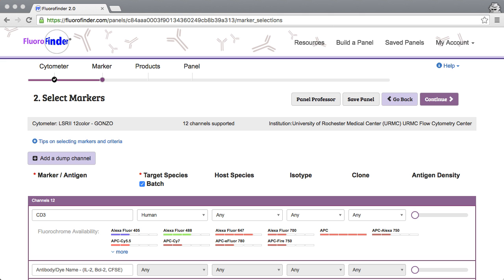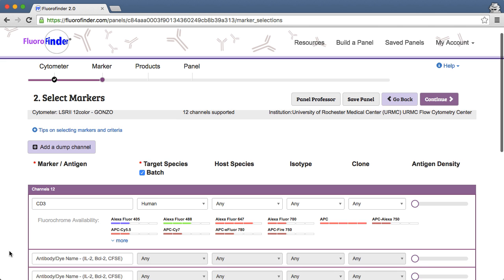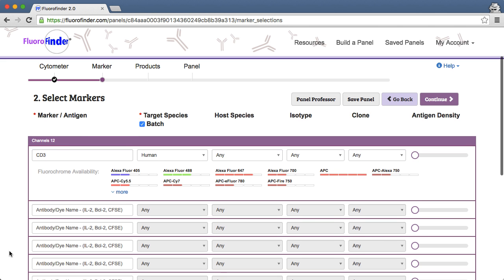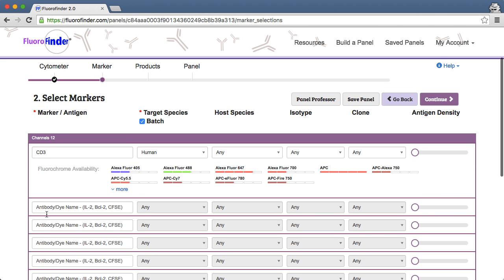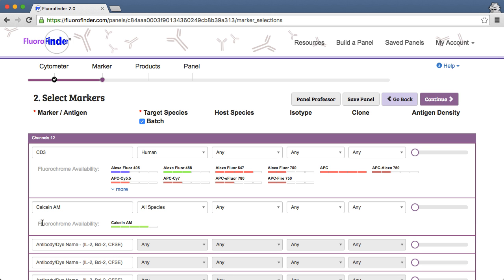We'll start off the panel design process by adding viability dyes in step 2 of FluoraFinder. As an example, I'll add Calcein-AM and DAPI to a basic panel.